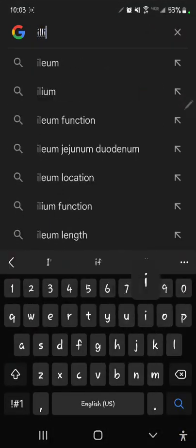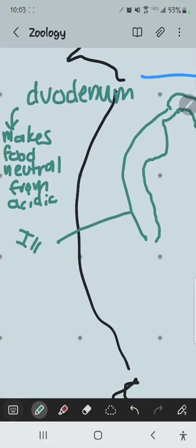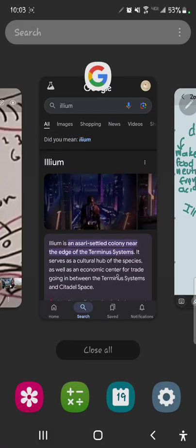The spiral valve is inside the ileum. So I would encourage you to go ahead and make a longitudinal cut. Basically, as food transfers here, rather than just shooting straight through, it corkscrews like a playground slide down through the ileum as it makes its way to the colon.